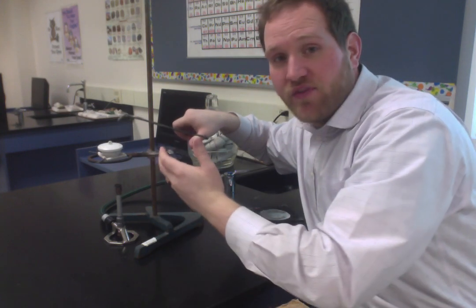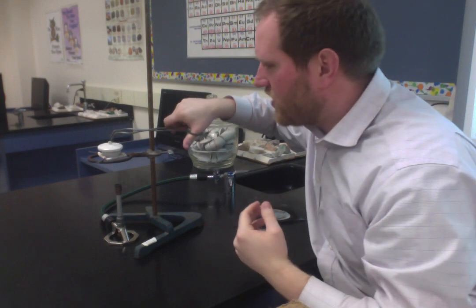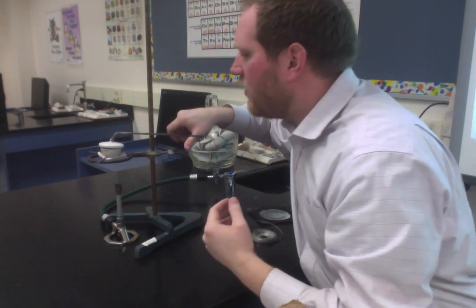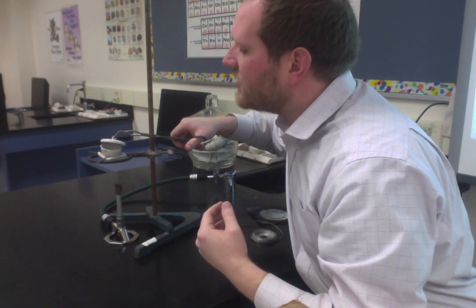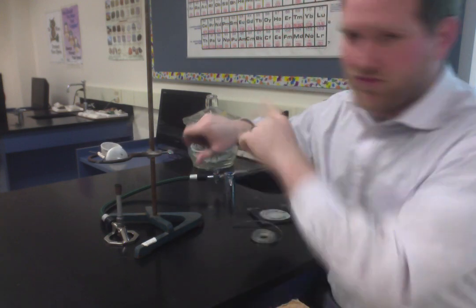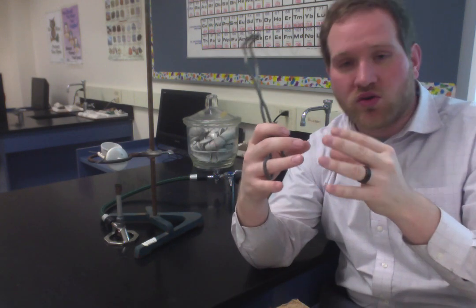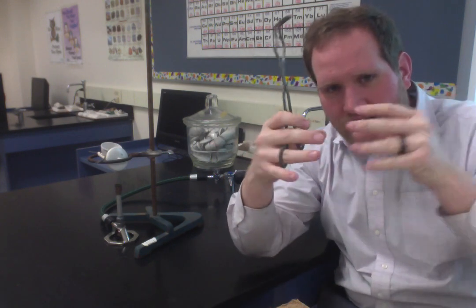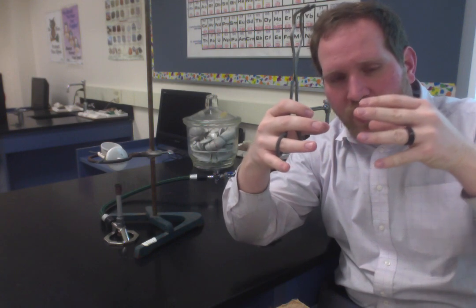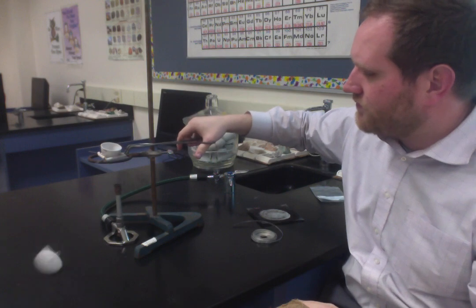Now keep in mind, it's going to be very hot, so you're not going to stick your face right in the Bunsen burner flame, but with your goggles on, of course, you're going to grip the lid, open it a little bit, look inside, and you're going to see the magnesium inside. Don't do what I just did. The magnesium inside is probably going to start out as an orange, and as you keep looking at it, it's going to get brighter and brighter, and then as soon as it starts to turn white, you close it up again. Okay?